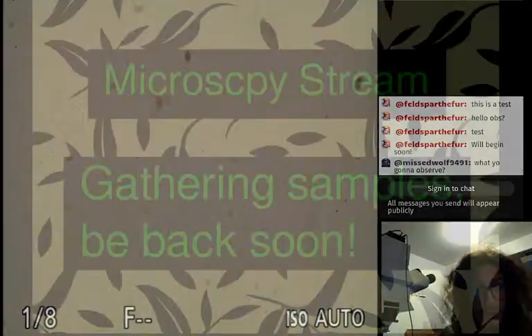Now let's do a dry sample one, and just maybe dry off my lens. Are you wet? Yeah, you're wet. Tissue. One moment, I will be right back.